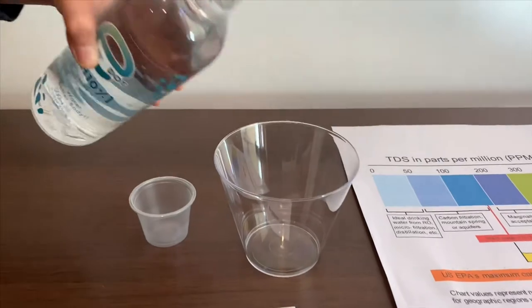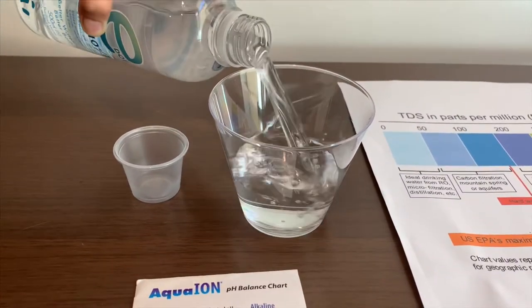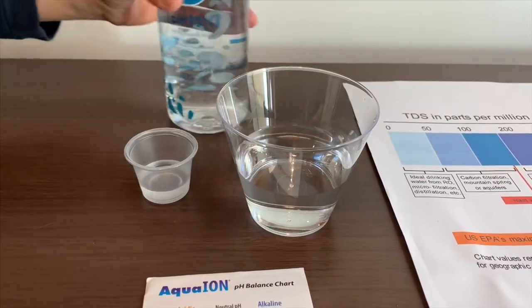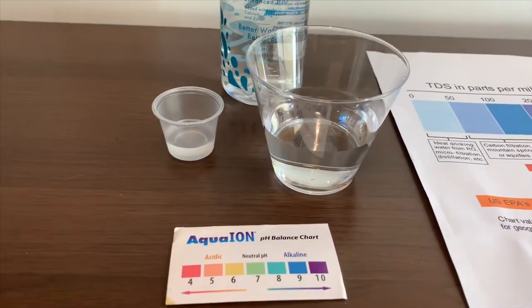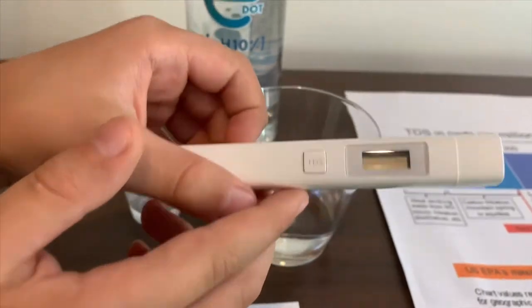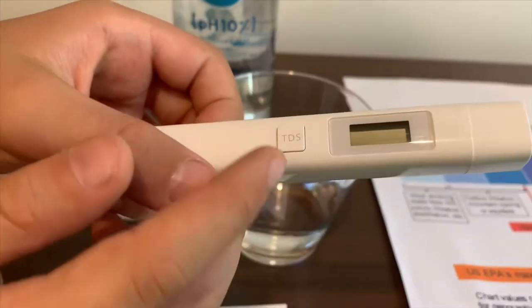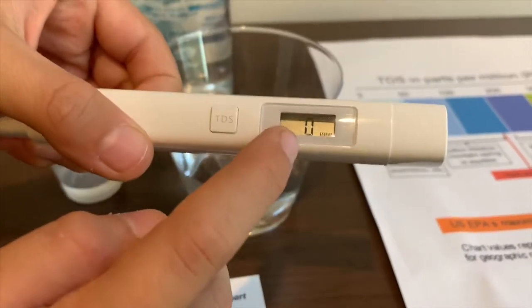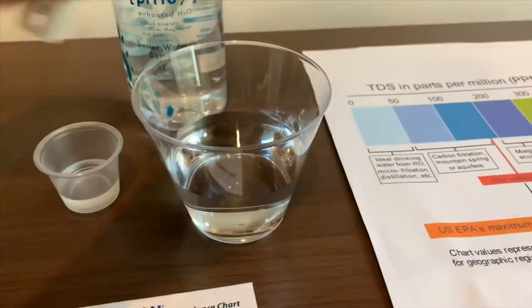Let's pour some water in. First, we're going to test the TDS level. If you want to buy this TDS tester, check the link down below. Turn on the TDS tester, make sure it says 0, and let's put it in.